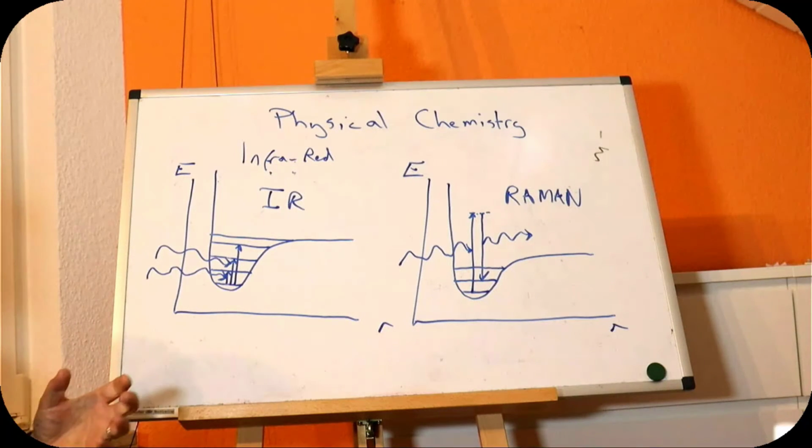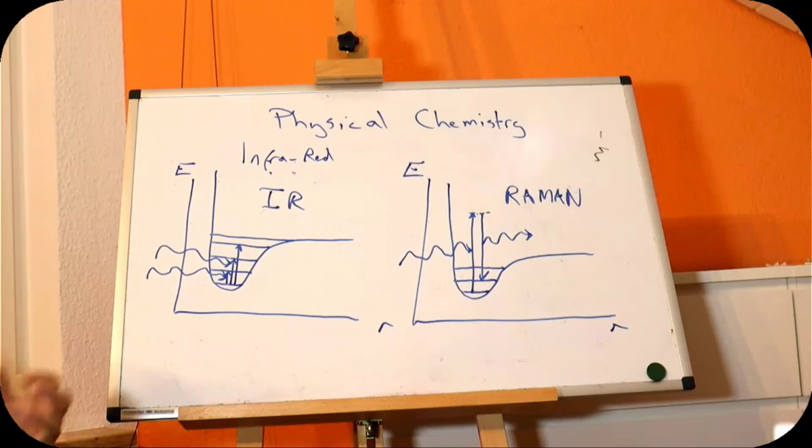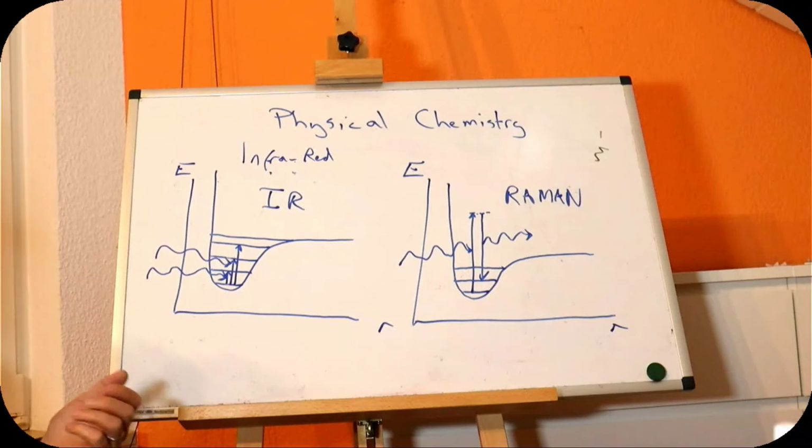Obviously, it's reasonably simple to generate infrared photons. What we really need is something that's hot, and so we need a particularly rubbish old-style light bulb, effectively a bit of wire that current goes through that gets hot, but not hot enough to emit visible radiation. So a really, really rubbish light bulb, or what people sell as an infrared heater, so just a piece of resistor.